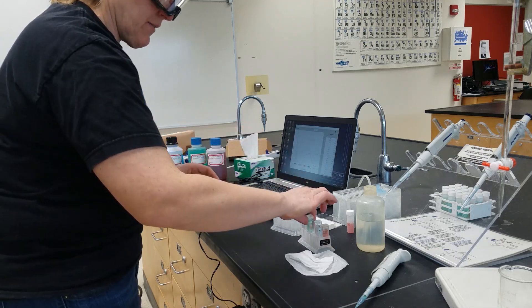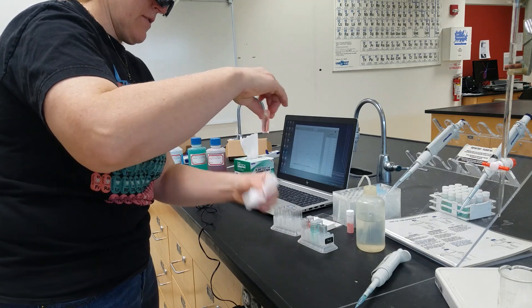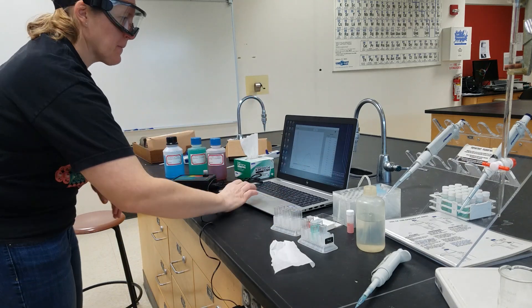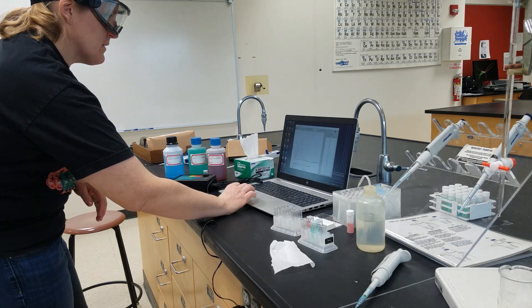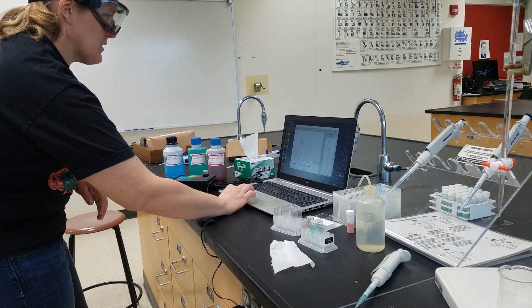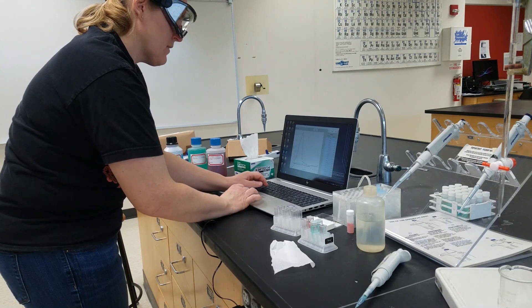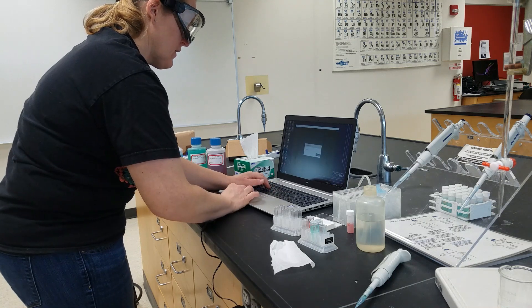The last one that we have to do is our unknown. So we take our unknown, place it into the spectrophotometer, and we hit collect. After a couple seconds, we hit stop. And we rename this data set — Unknown 100.